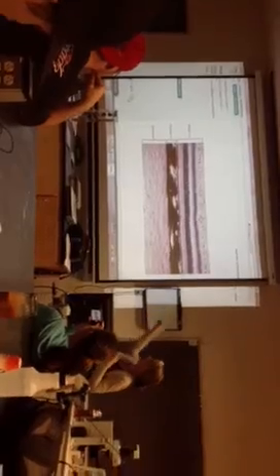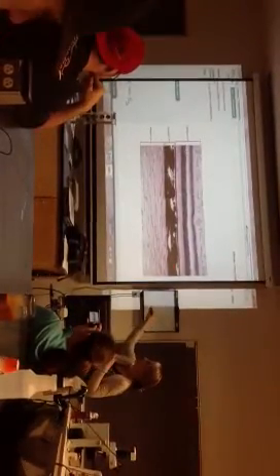It's that dense fibrous tissue. You can see all those collagen fibers there. Here's the choroid. It looks black or brown. It's got all the pigmentation and the blood supply. And here is the retina.